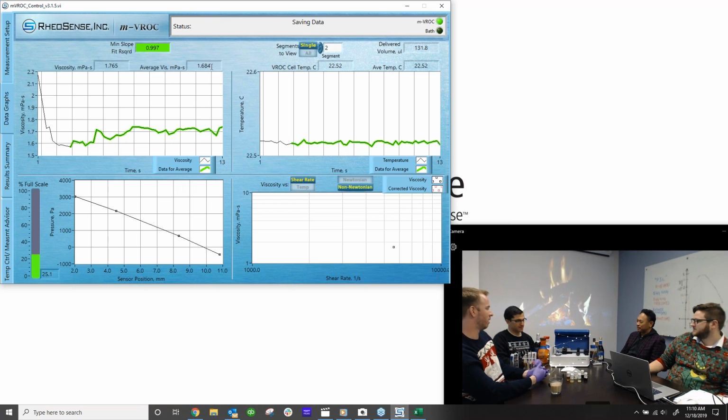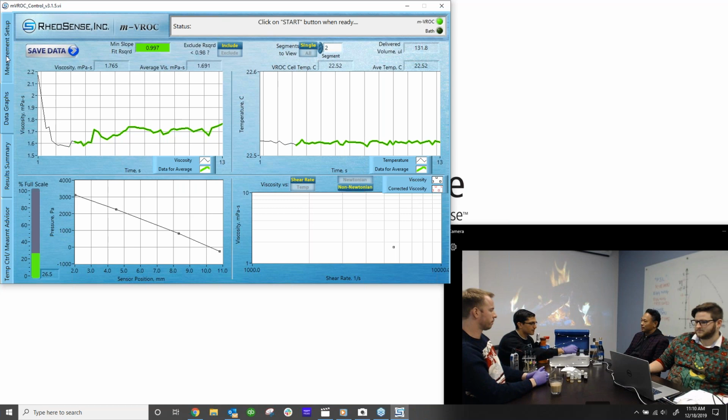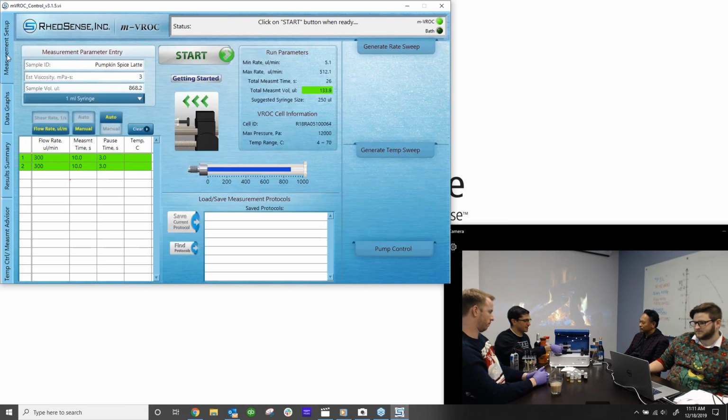All right. So now that the testing is complete, we can now switch our samples. So first step is to move the pusher block away. So, well, actually, excuse me. First step is to open the jacket and then close the valve so that we can't accidentally overpressure the chip. And then we move the pusher block back. And then we can remove the syringe gently.